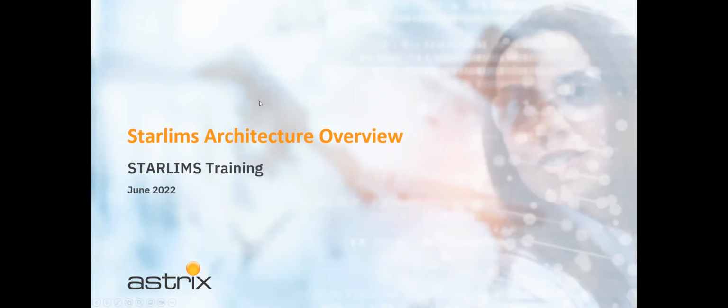Okay, so after our introductions for the STARLIMS architecture overview training today, I would like to state this will be approximately 30 minutes. I'm going to follow this up with a Menti, not a very long one, but it'll give you a brief light bulb kind of, oops, did he talk about that in the training, kind of an incident there, and then we'll be able to move on.